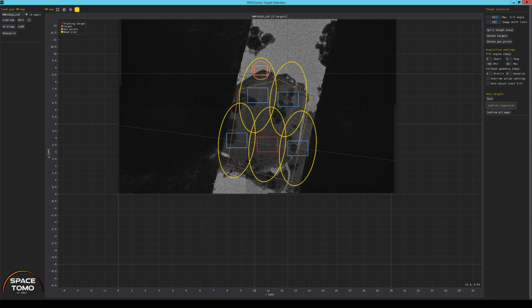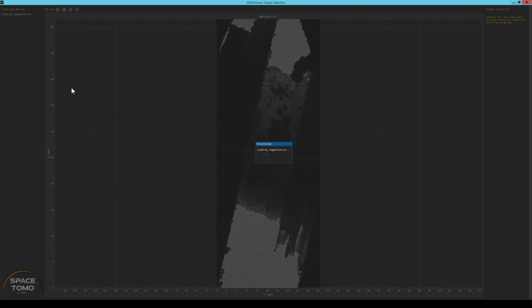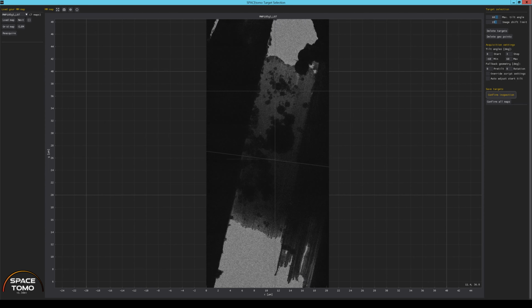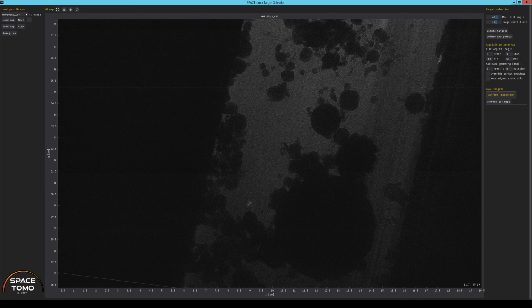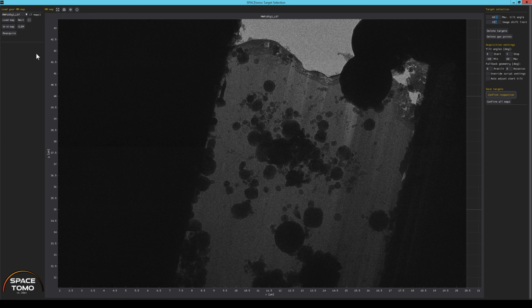And in this case, you can actually see that it's quite advantageous to have a higher mag and smaller beam diameter focus area, so you can place and squeeze your geopoints in between your actual targets without causing too much exposure damage. All right, so this last one actually looks quite contaminated again. So maybe we should just go ahead and set this one up for a reacquisition.